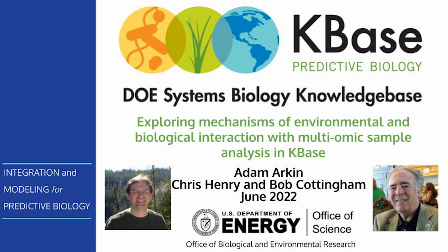And so we've been designing KBase to enable teams of scientists to collaboratively work together, to bring their data together, and to organize them and share them with each other so you can build these sorts of workflows. So I'm going to take you through a bit of that story using a program that I am very intimate with, which is the Enigma program.